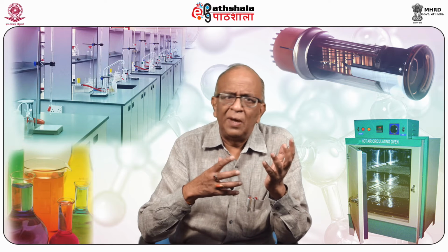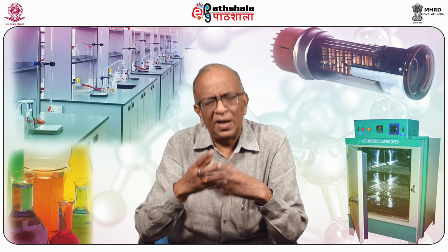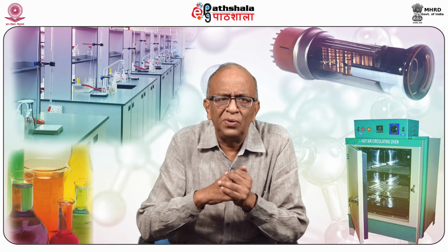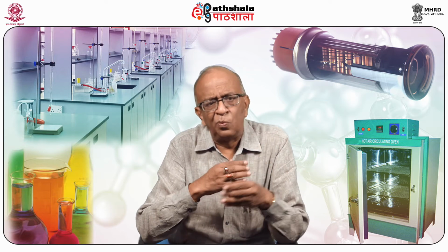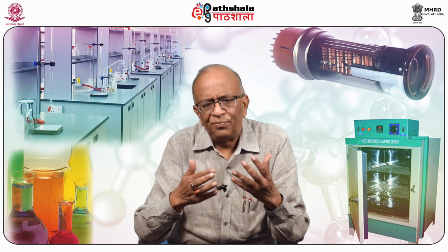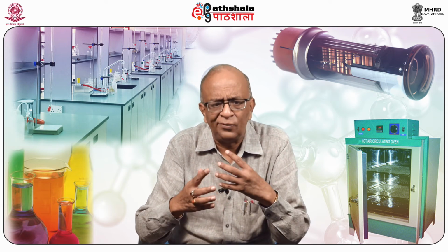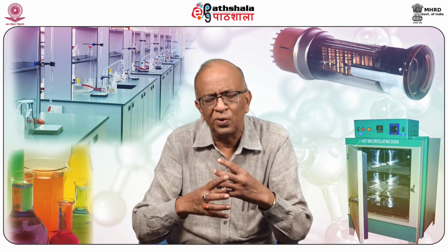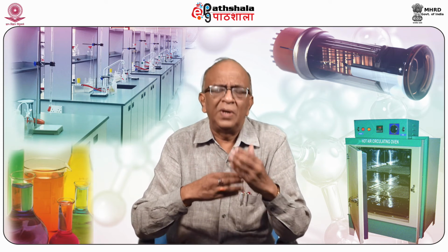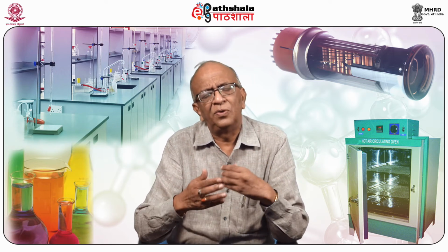As soon as the sample is introduced into the column, it vaporizes, and along with the carrier gas it moves over the liquid supported on a solid already present there. That is why it is gas liquid chromatography. Why is it gas liquid chromatography? Because here separation is taking place between the mobile phase, which is a gas, and the stationary phase, which is a liquid.